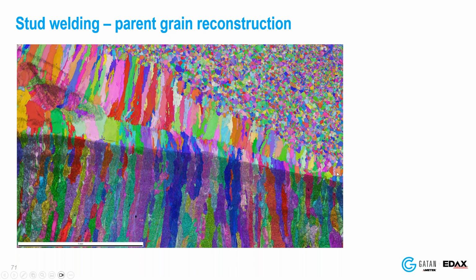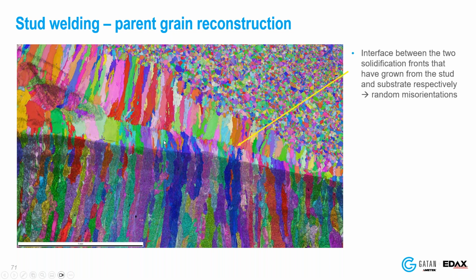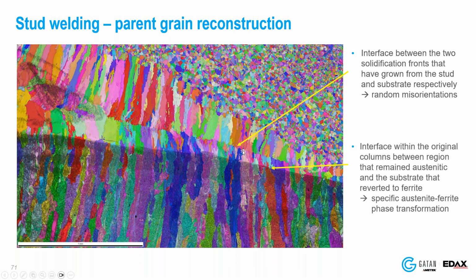And the reason why this columnar structure was left over is chemical. So also there, the reason why we did not have misorientation preference is it's just random, it's butting against each other. And here we have a chemical segregation.